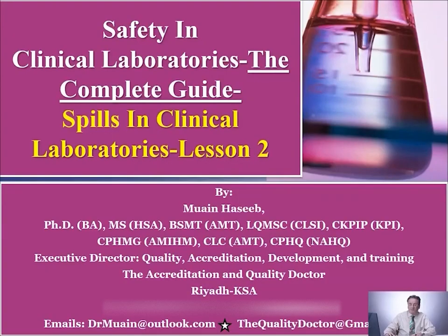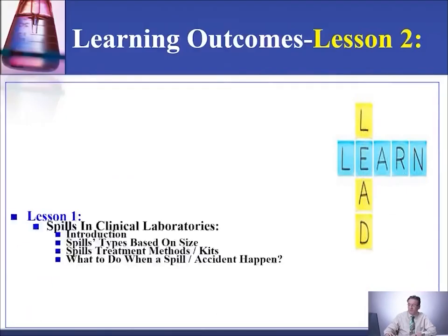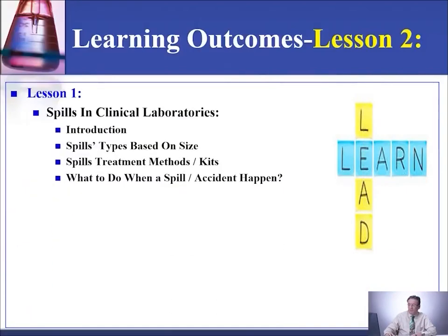Hi there, this is Dr. Ma'in Hasib with lesson 2 on spills in clinical laboratories and how to manage them. If you recall, in lesson 1, I gave you a brief introduction about the subject. We talked about spill types based on size, spill treatment method kits, and what to do when a spill accident happens.